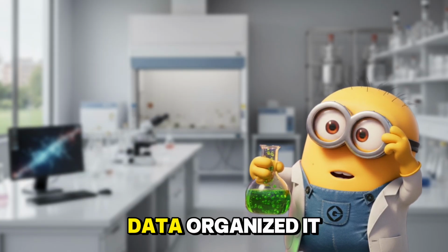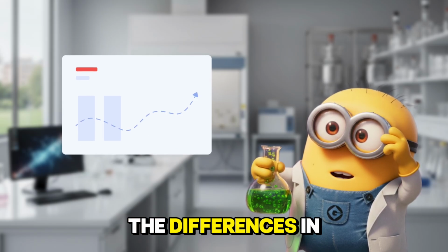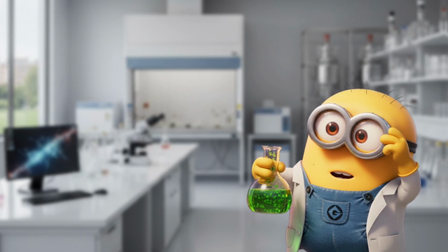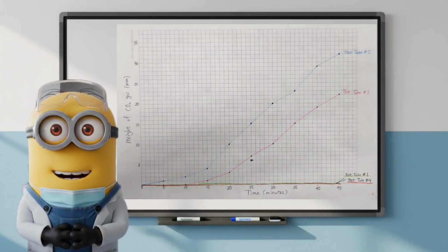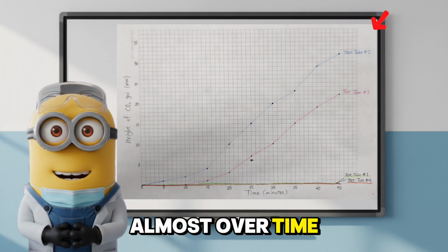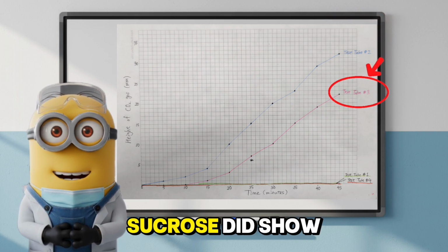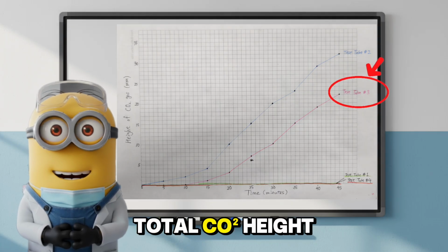We collected our data, organized it into a table, and then graphed the results to clearly show the differences in CO2 production. Our results showed that glucose fermented the fastest. Tube 2, with glucose, produced the greatest height of CO2 bubbles over time. Tube 3, with sucrose, did show fermentation, but at a slower rate and with a lower total CO2 height.